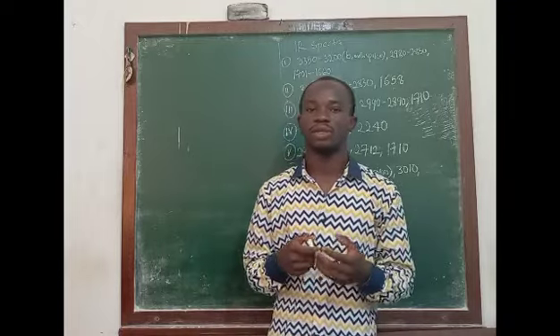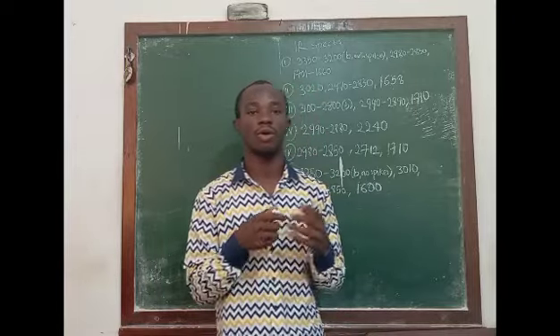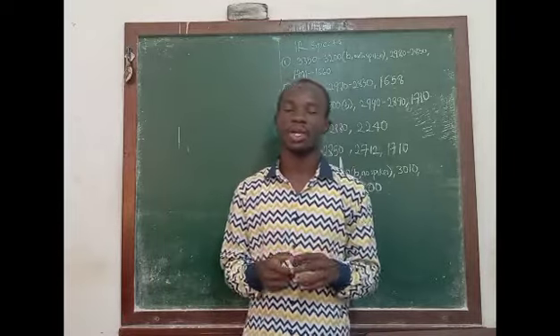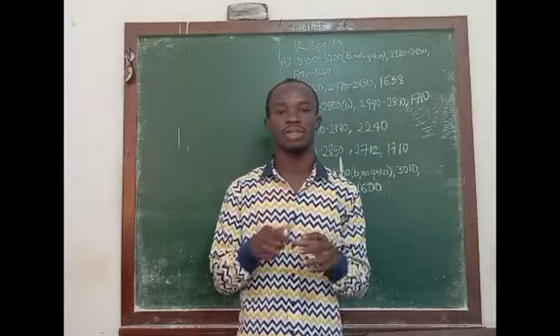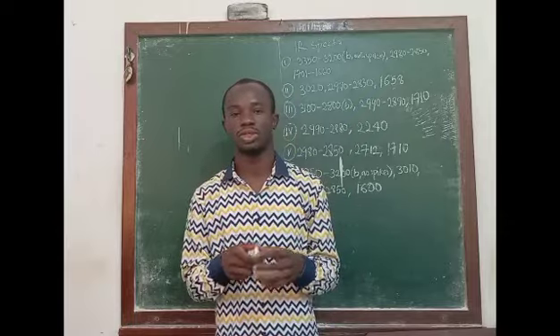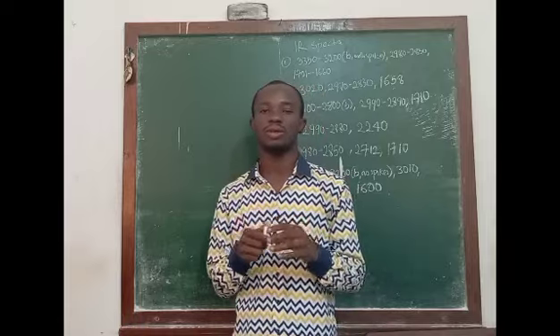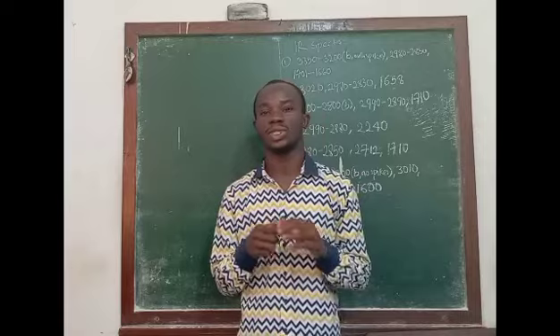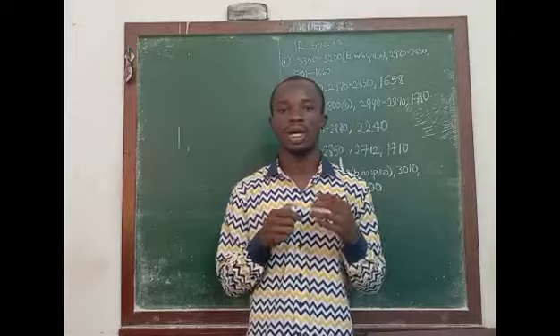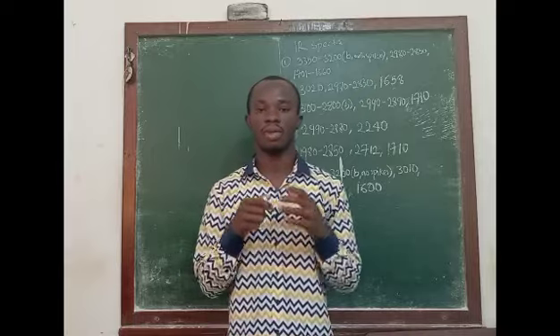So we've talked about how to know whether the compound represented by your IR spectrum is saturated or unsaturated by checking for signals around 3000. We also talked about the fact that the signal for carbonyl compounds always falls between 1700 and 1800. But in some cases, due to conjugation or mesomeric effect, they can also fall a little bit below 1700. I will try to give us some diagnostic signals that can be used to differentiate different carbonyls from one another. In this video, I'm going to be giving us signals that we can always use to identify alcohols.